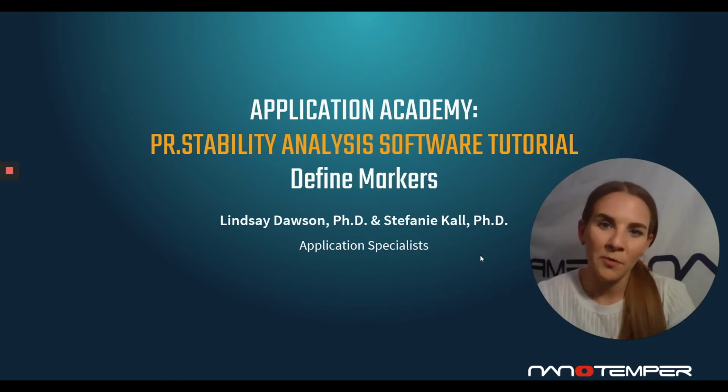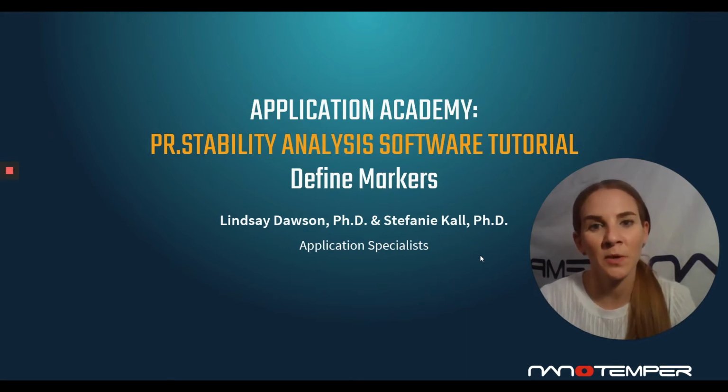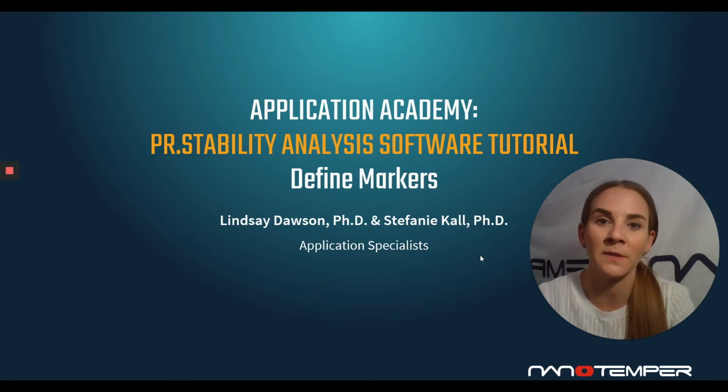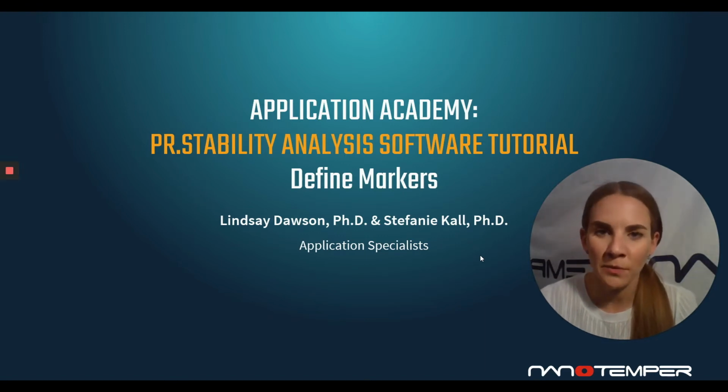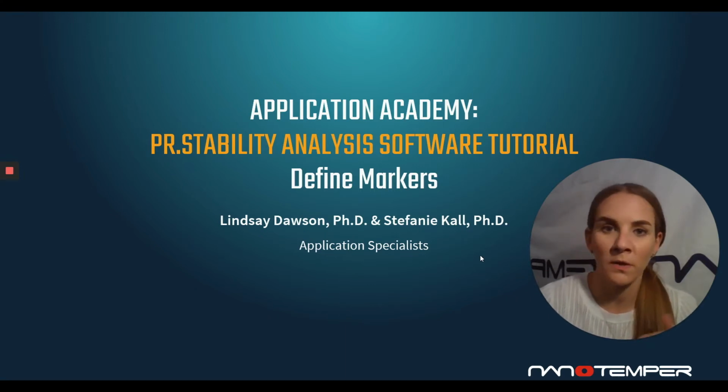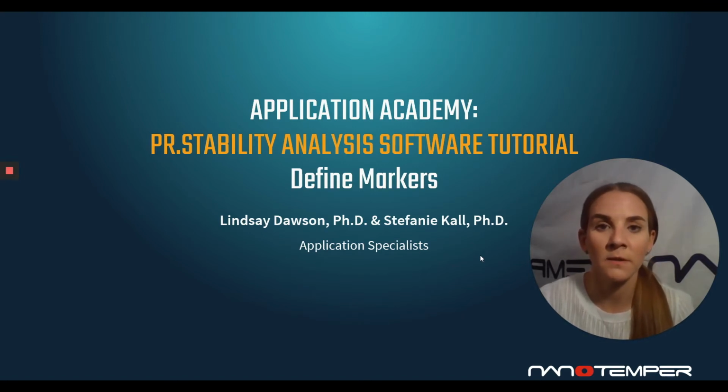In this tutorial, we're going to be talking about how the definition of markers varies slightly from the PR.ThermControl and PR.ChemControl softwares to added functionality in our PR.StabilityAnalysis software. Now, I know that most of you are already familiar with the concept of markers, so we really want to touch on the additional functionality, as I mentioned, that the PR.StabilityAnalysis software is providing you in adding or deleting markers in your data sets.